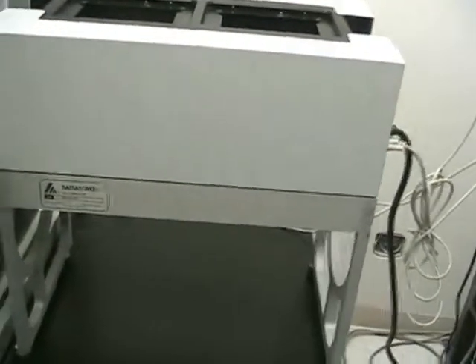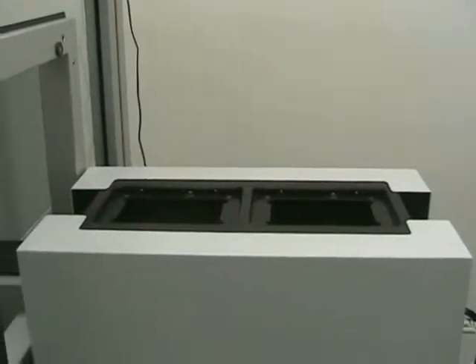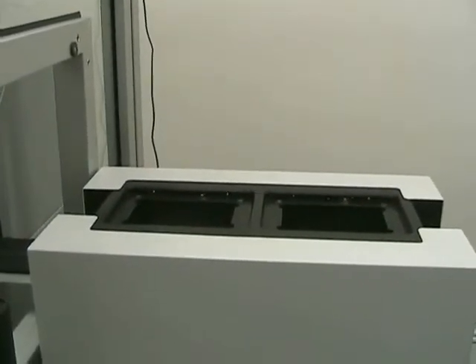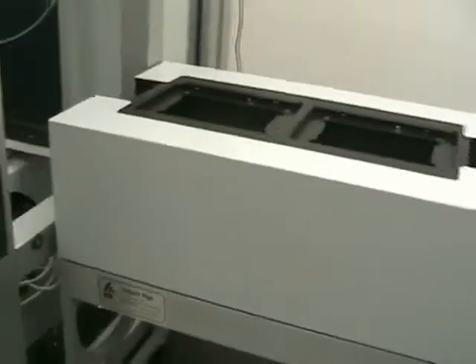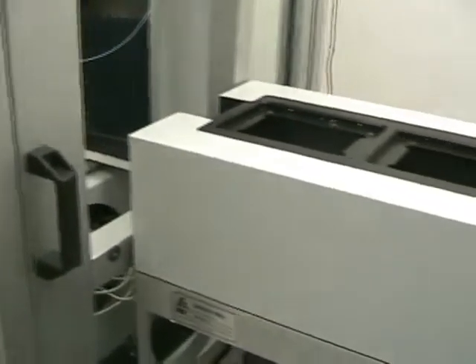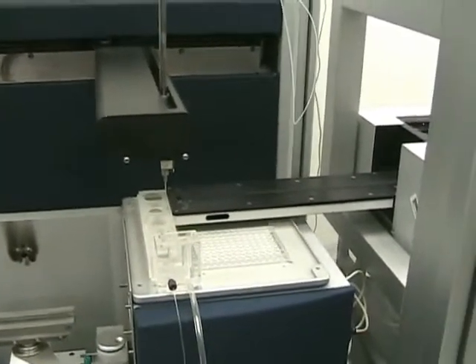The other option I was mentioning is the Aurora plate stacker. You can see the serial number of it here. What it does is take plates off the stacks — which we don't have, as when we got the unit it was missing the actual stacks. But the robotic arm itself does feed flawlessly into the reader and it works just fine.